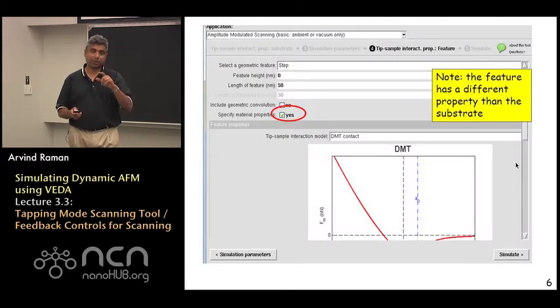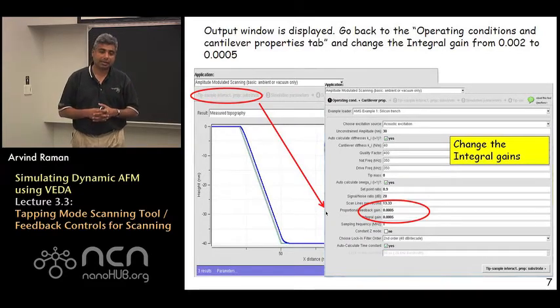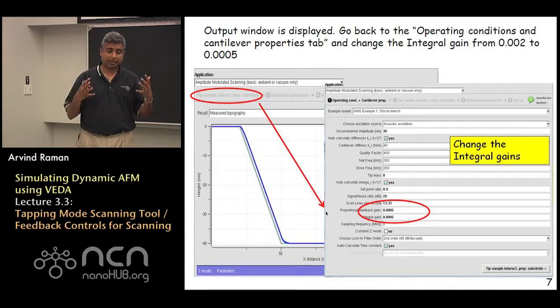When you go through this process and click on the simulate button, you can scan and it will take a few seconds and the result is that the resulting answer is going to be displayed in the following fashion.